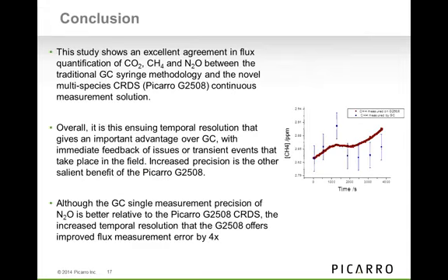So as a conclusion, we've shown that both instruments show the same story of N2O, methane, and CO2 fluxes, with it ultimately boiling down to this temporal resolution that the G2508 gives us. And in addition, it gives us this great immediate feedback so we can see what's actually going on.